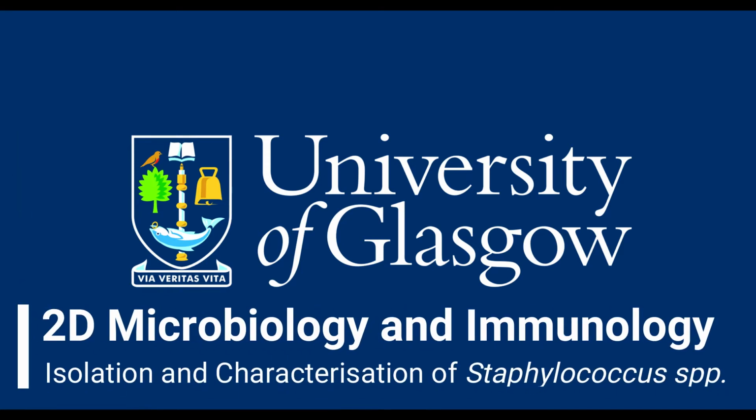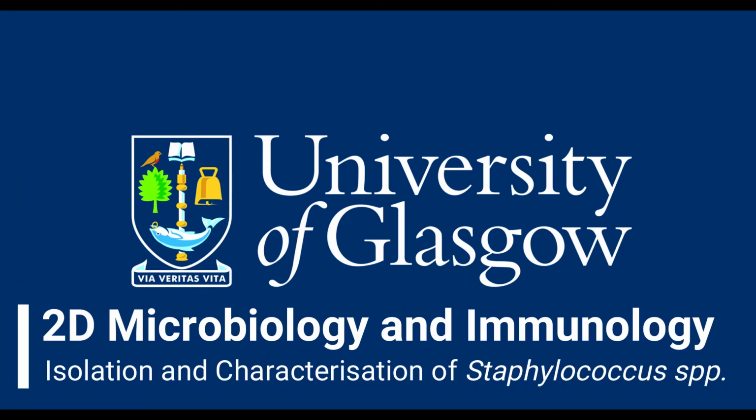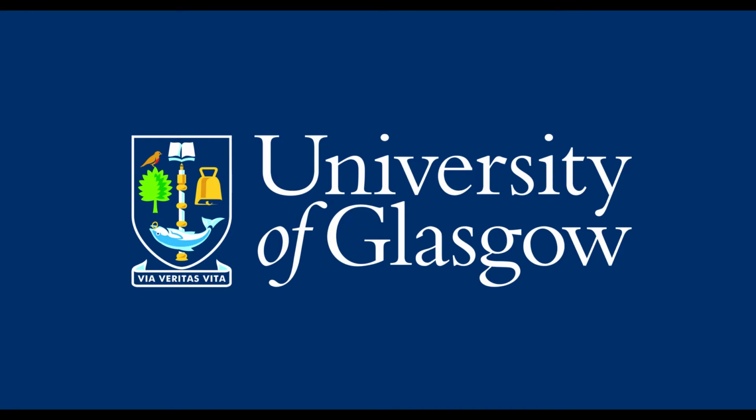This video will be the first of 3 giving an overview of how to isolate and characterise commensal Staphylococci. Staphylococcus species are commonly opportunistic pathogens that cause sores, blisters, impetigo, boils, carbuncles, sepsis, and toxic shock syndrome. The problem pathogen MRSA is also a member of the Staphylococcus genus.